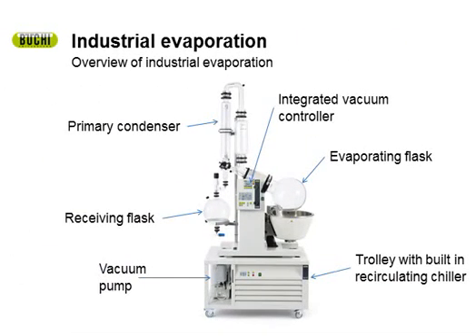Okay, now let's get into industrial evaporation. Industrial evaporation is very similar to a benchtop rotary evaporator. In fact, all the parameters that apply to a benchtop rotary evaporator apply to an industrial evaporator. So let's say you already have your method development worked out on a benchtop rotary evaporator. You don't have to rework it on industrial. You can use the exact same method, the exact same parameters.